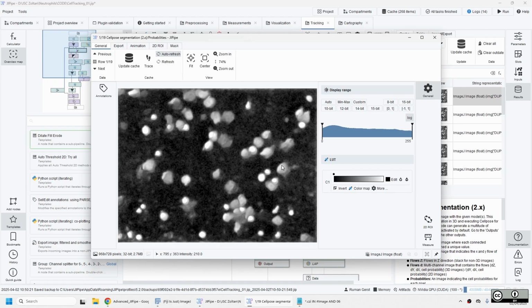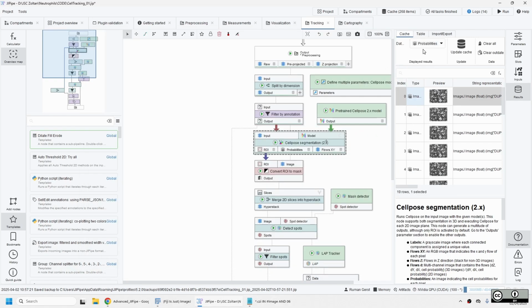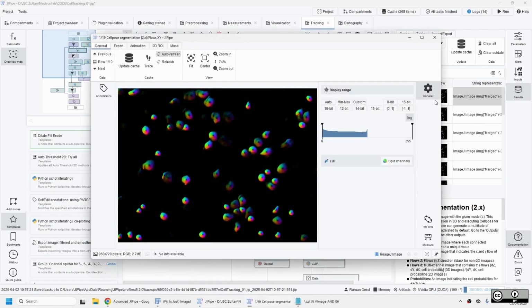And then as an image analyst, what you can also do is if you're not happy with the region of interest that it finds, you can use this map to do your own segmentation. Because now it's simply intensity-based segmentation. So you would denoise it and run automated threshold on it. We sometimes do that. And the last output which I ask for is the so-called flow.